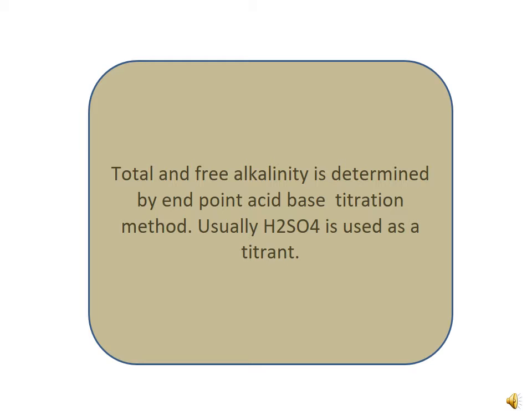And so the total and free alkalinity is determined by the acid-base titration, in which we use sulfuric acid as a titrant. The titrand is a sample of the cleaning bath, and through the acid-base titration we measure the alkalinity of the cleaning bath. That's all from my side. Now Huria will proceed.